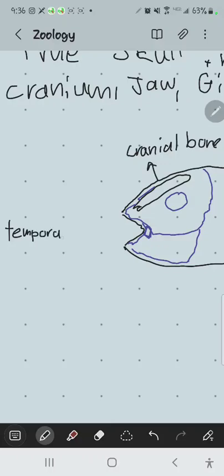It is called the TMJ to you. Your temporomandibular joint basically is a little cartilaginous piece that cushions your jaw against your skull. So this is called the TMJ, but really this is the mandibular arch.